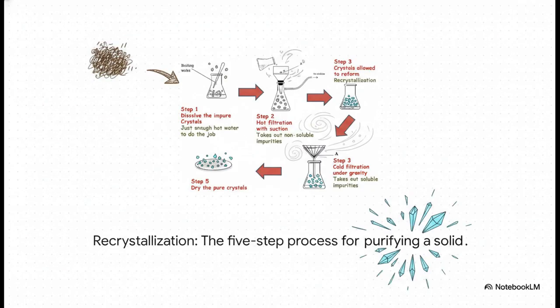But what if your analyte is a solid? Well, for that, there's a fantastic technique called recrystallization. This image gives us a great bird's-eye view of the whole process, taking you from a messy solid all the way to beautiful, pure crystals. Let's break down how it works.